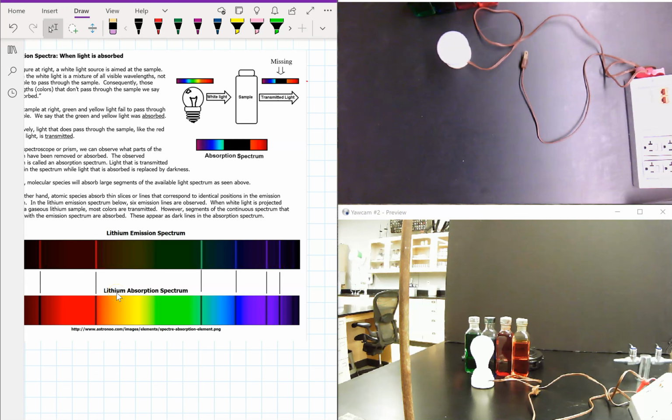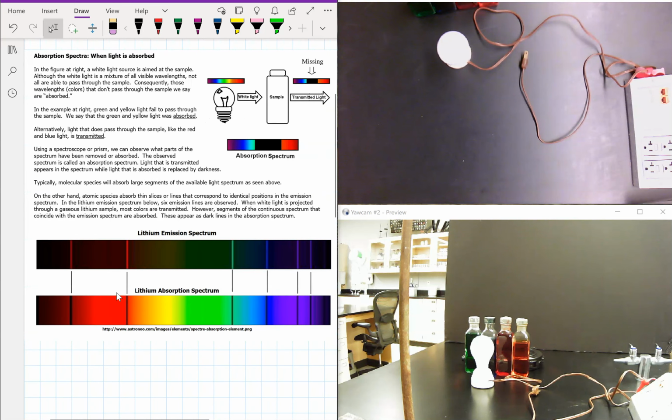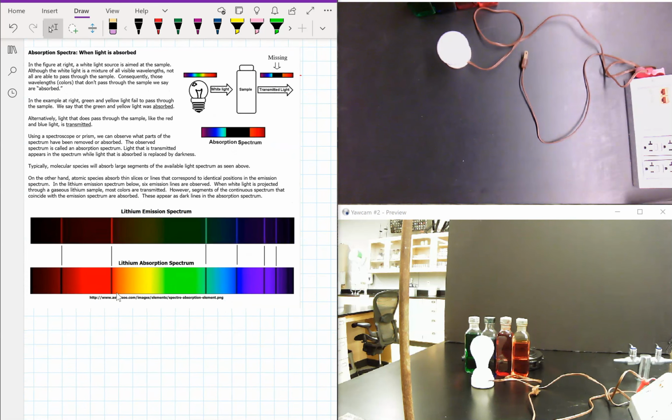In this part of the spectroscopy experiment, you're going to be looking at something different. In other experiments, you've looked at what are known as emission spectra. These are the spectra that are produced when an atom is excited and produces light that we then look at with the spectroscope. In this experiment, though, we're going to look at something different. This is called absorption spectra. And absorption spectra are actually related to emission spectrum.